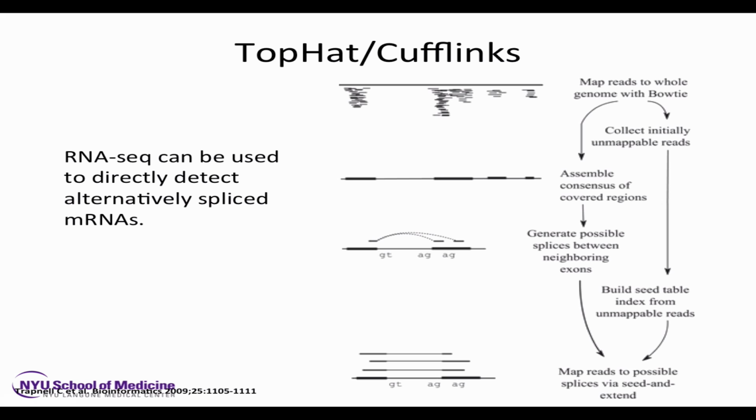When it finds a shorter match of some useful length, 10, 12, 15 bases, and then what looks like a gap, many bases that don't match, it jumps forward and slides along looking for where the alignment picks up again.